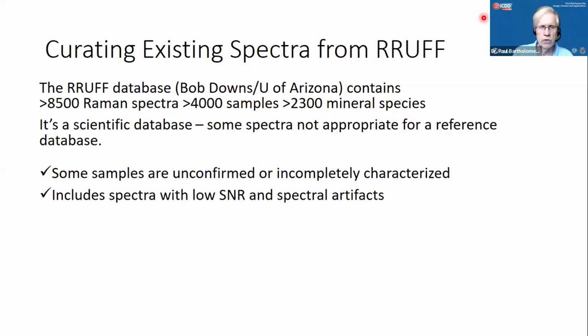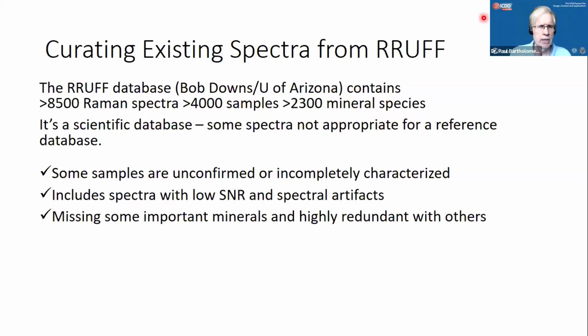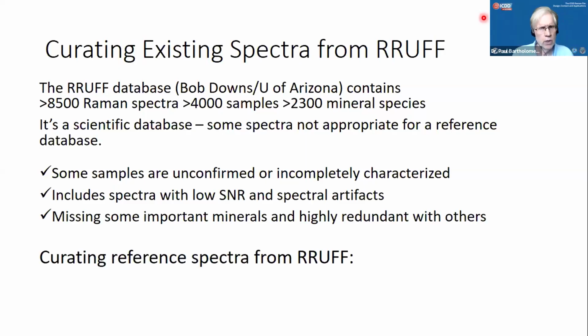Some spectra do not have a high signal to noise ratio. Some of them have spectral artifacts. The content is missing some important minerals and highly redundant in others. So for reference spectra, I needed to curate reference spectra out of RRUFF. My first consideration is to take only spectra from fully verified minerals.